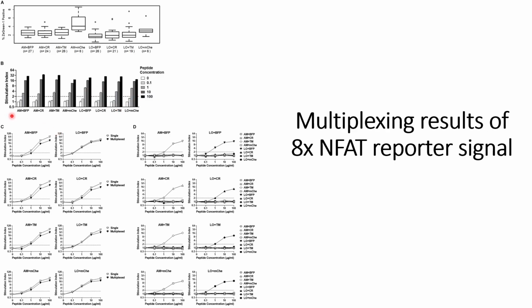Thereafter, they wanted to check the changes they see when a single fluorescence channel is activated compared with the multiplex signals that are activated. When they did it for all the 8 fluorescence combinations, they were able to see that in all the cases the signals observed from the single fluorescence reporter compared to the multiple fluorescence reporters are almost the same. That can be seen here.